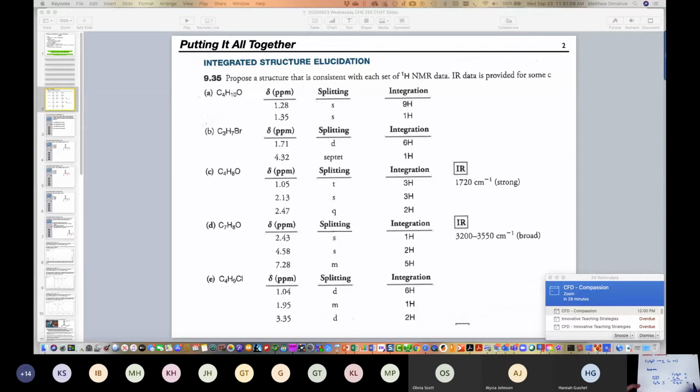And so the reason that's important is because you only have a single carbon, so you can't have a pi bond or a ring in a single carbon, but it sort of leads us in the right direction. So we've accounted for 6 of those carbons. We can't just have a benzene ring itself, because otherwise how do we stick this back on there? So let's look at the data now.